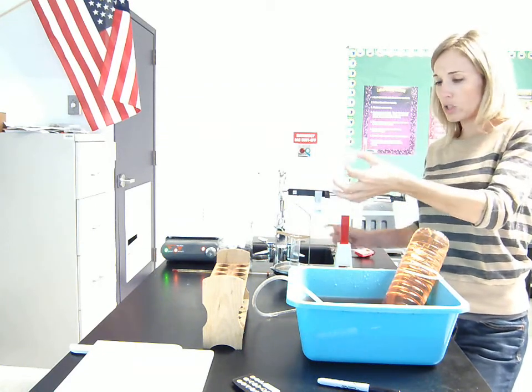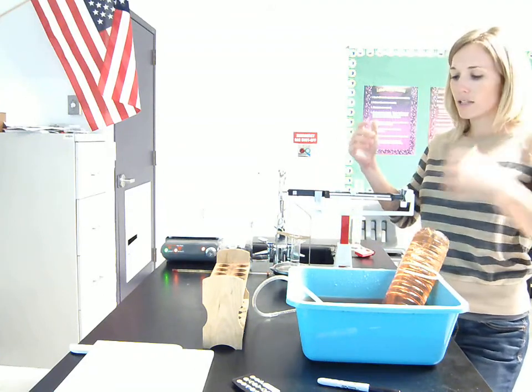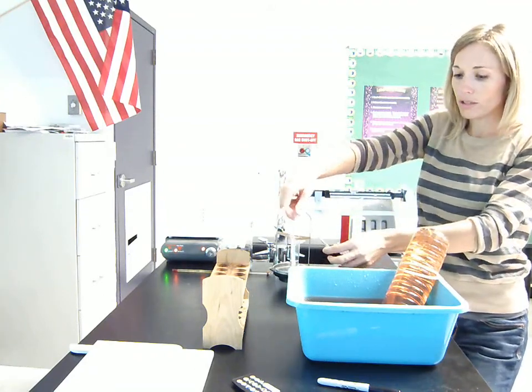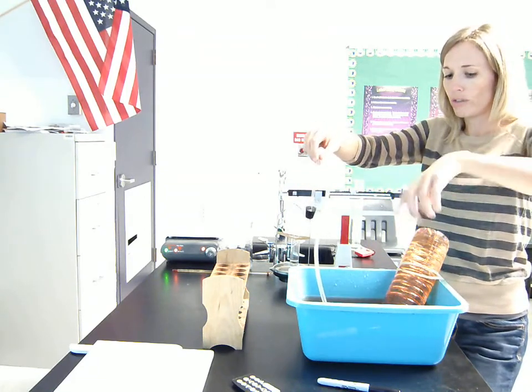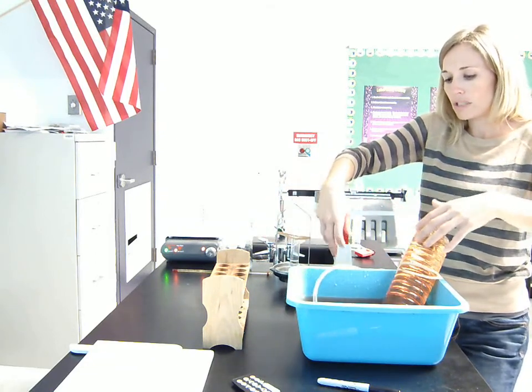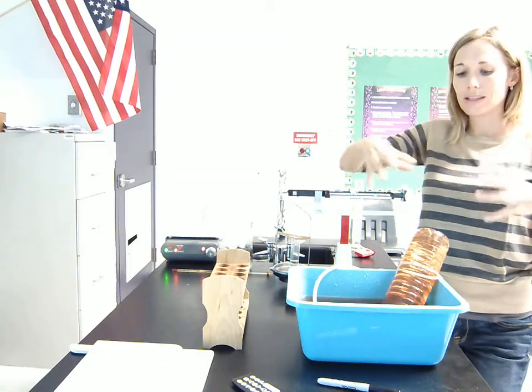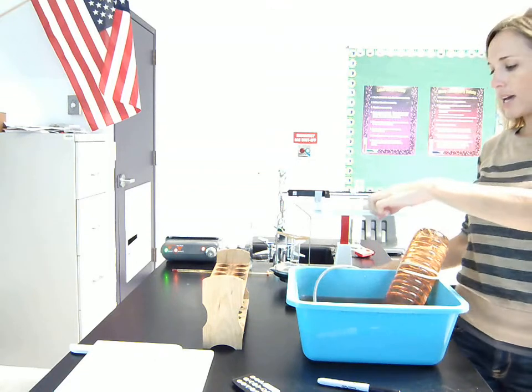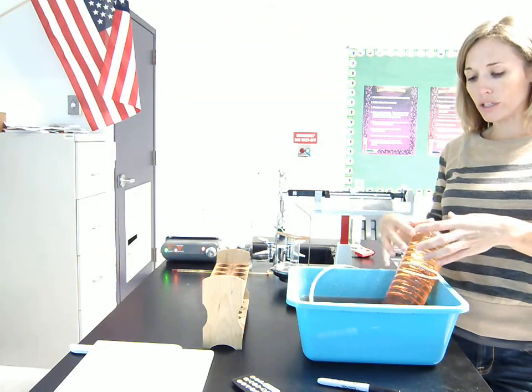We know from past experience that breaking the Alka-Seltzer and putting it in the test tube, the minute it hits the water, it creates lots of gas. As soon as we drop the Alka-Seltzer into the test tube, we're going to stopper it so that we can purposefully transfer all that gas over here into this collection bottle. We've done this setup before as well when we did the baking soda lab, because we set this up also in order to collect a gas. So what's going to happen is, as the gas travels through the delivery tube, it's going to displace the water in the bottle. So then we'll have created a gas and we'll have contained it over here in this bottle.